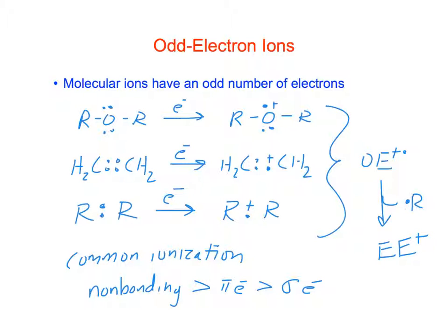And if we see an ion and we figure out the molecular formula of an even electron ion, we'll end up with an unsaturation number that's a half value, like 5.5 or something like that. And if we did that, that would tell us that that has to be a fragment ion as well.